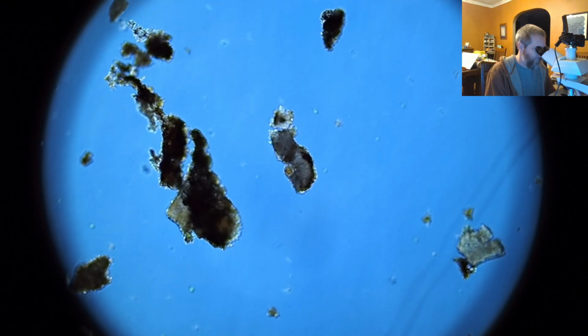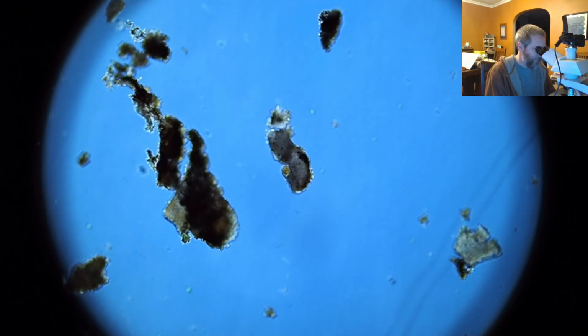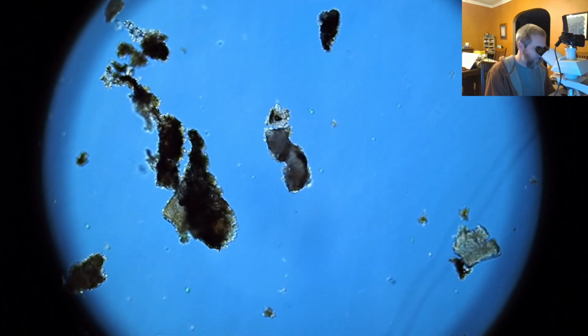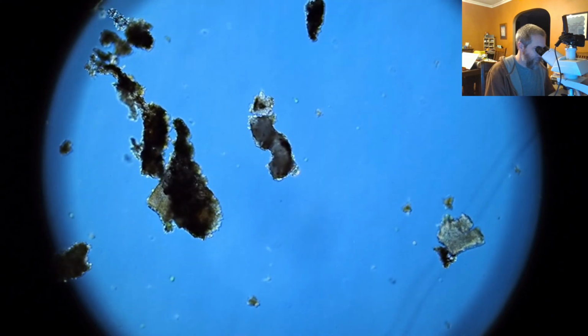So what's that? There's a little tiny water bear right there, a little baby one, or a different species that's just smaller maybe. He's crawling around. You can see his face now.